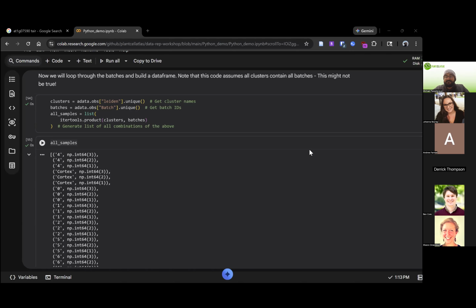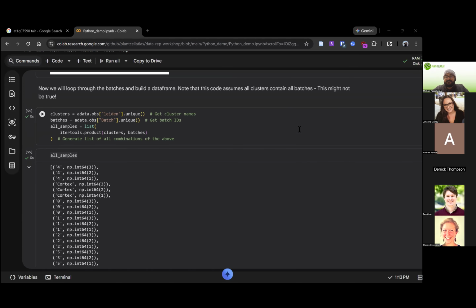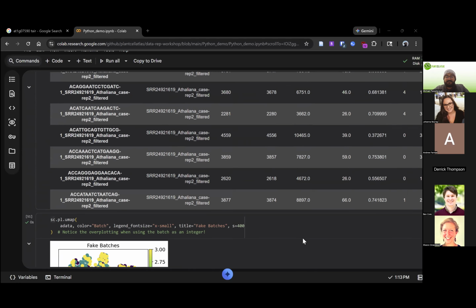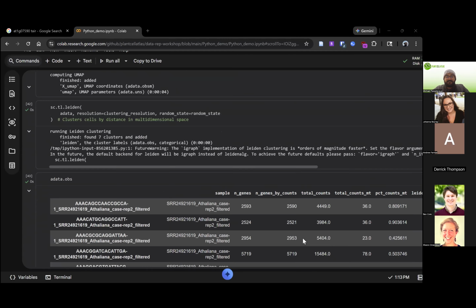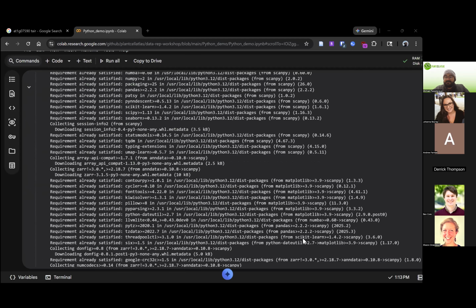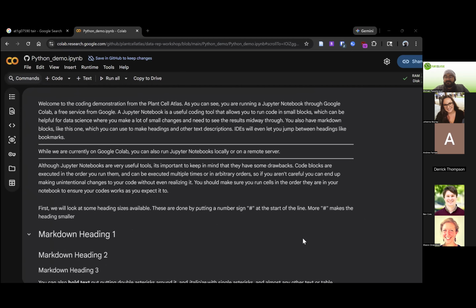I should have also mentioned yesterday, which I think I failed to do, that in the Google Drive I shared, we do have a spreadsheet of marker genes based on the Arabidopsis root atlas that Rachel Shahan produced when she was at Phil Benfey's lab. Those can be used to help explore the data that we provided. I think there were only 4 cell types that we included in this, so don't expect this to be a very representative data set. It's a very slimmed down data set.